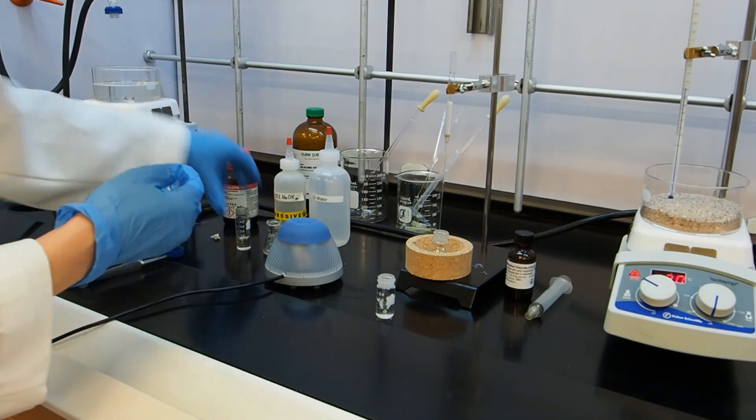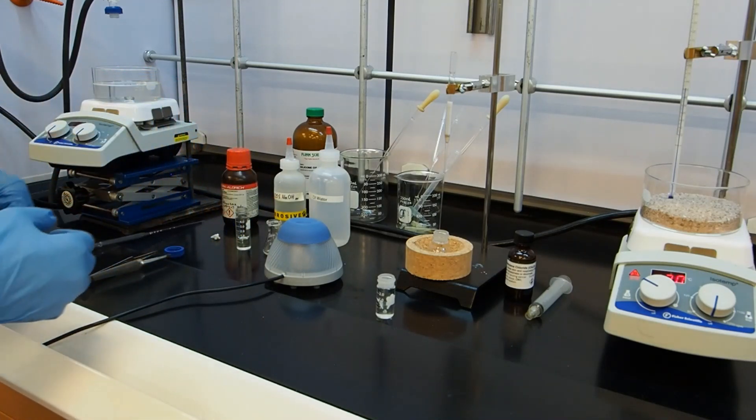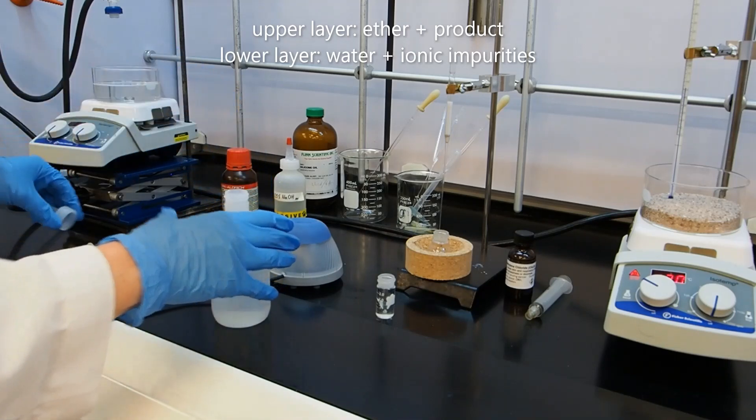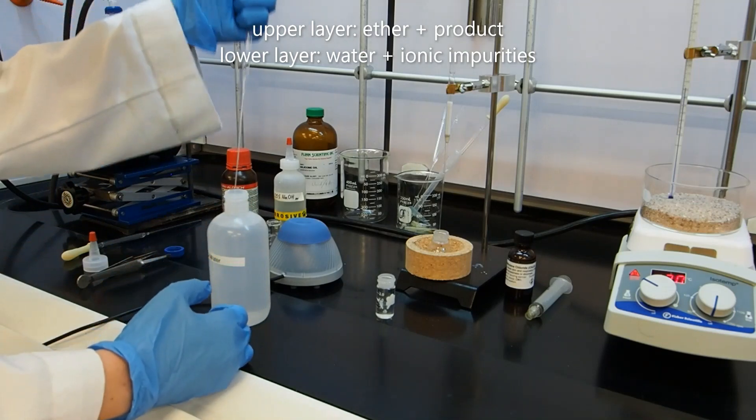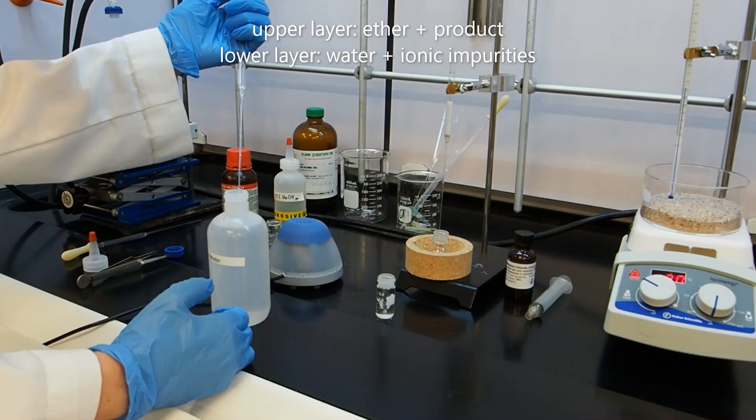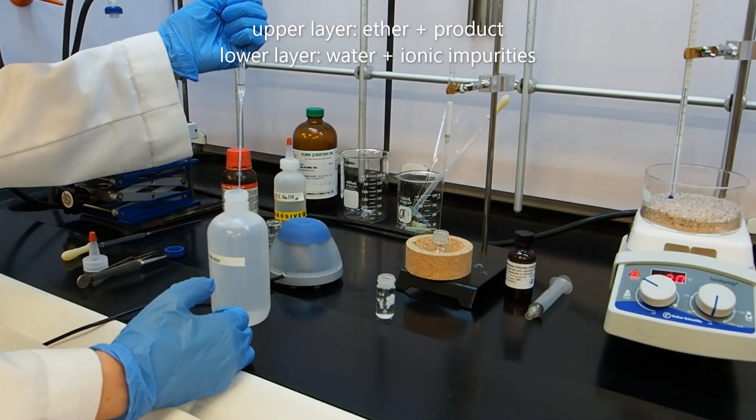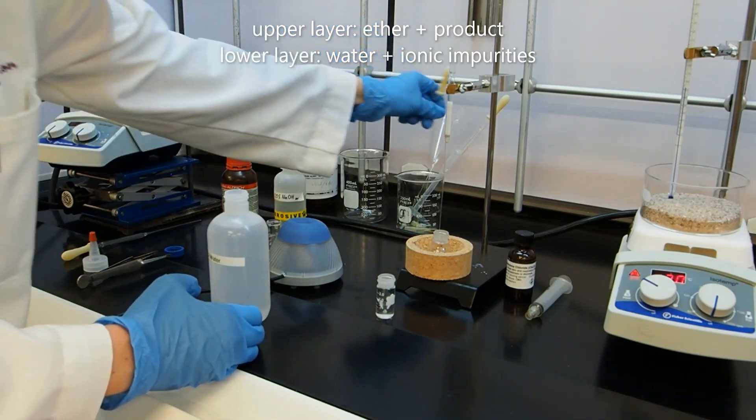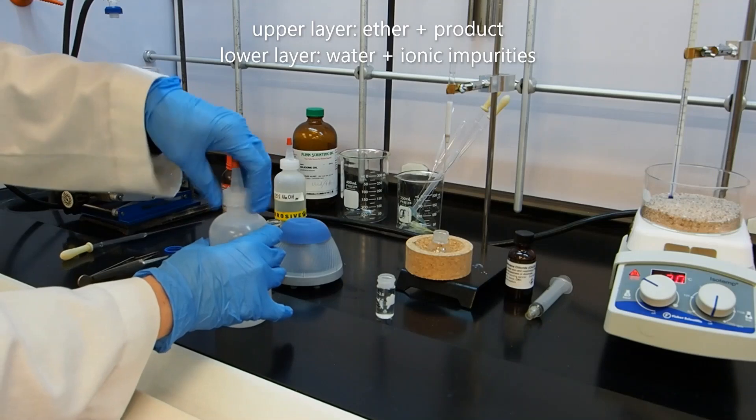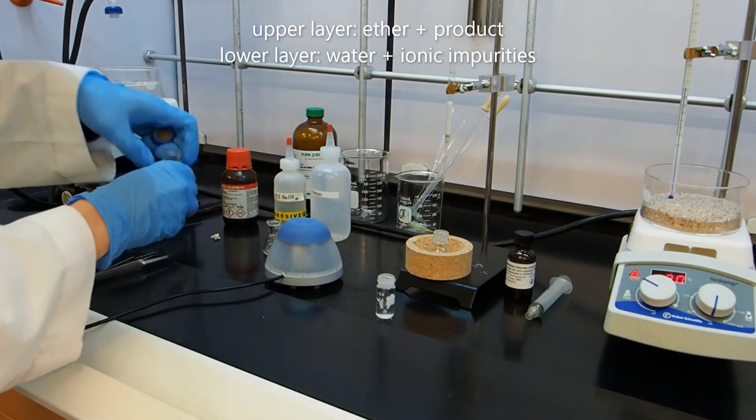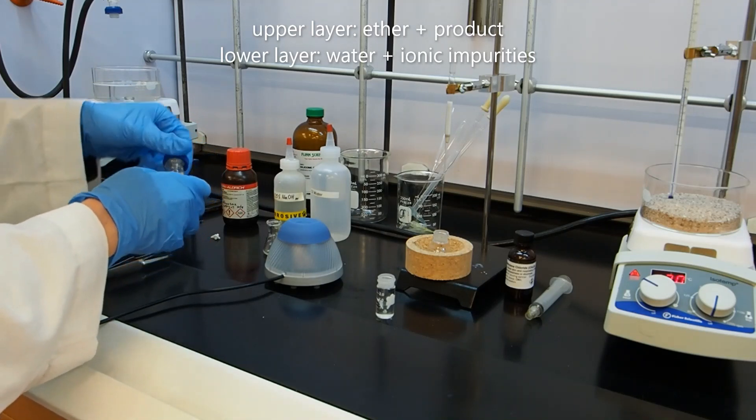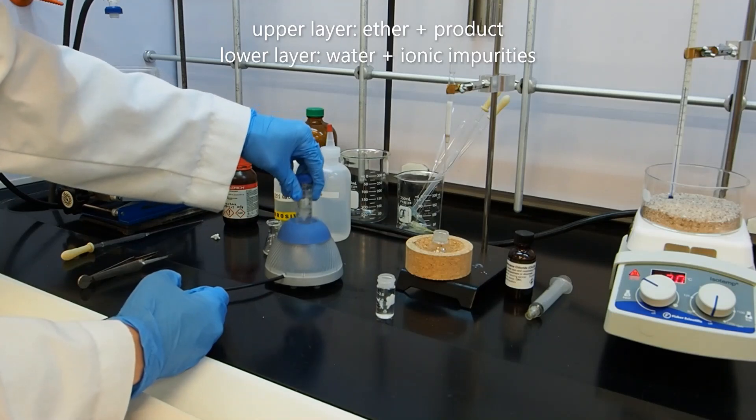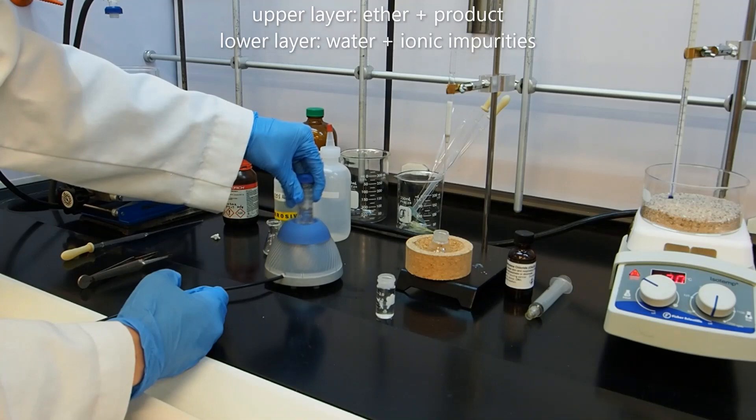The last thing we're going to do is what's called a water wash. It's just to get any remaining salt impurities out of our organic layer. We only need about 200 microliters of water. So I'm going to suck up a mil and let all but about a fifth of it out. I'm going to add that to my conical vial and do the same thing I did before where I'm going to cap and mix the two layers.